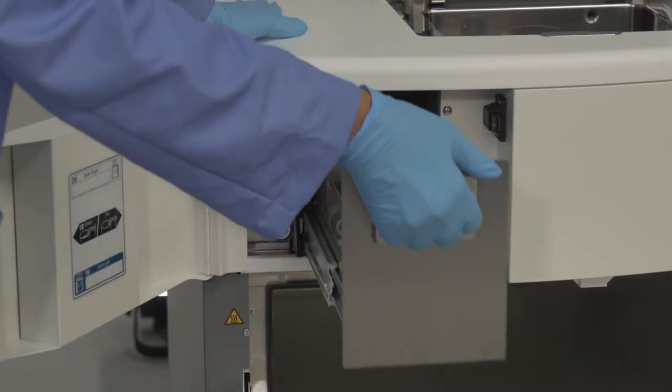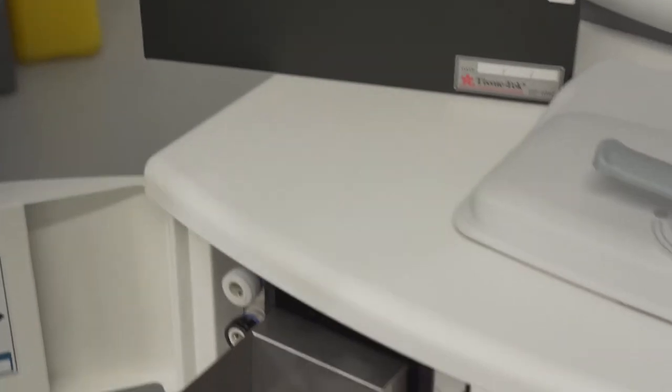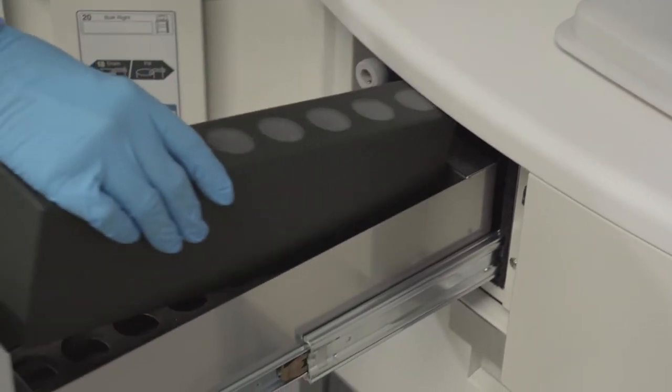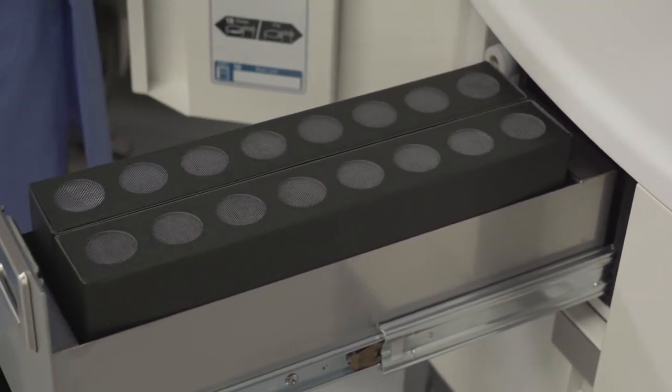The fume control system located here on the side of the processor contains two activated carbon filters that absorb fumes from the retort and oven compartments. We recommend that the filters be replaced monthly.